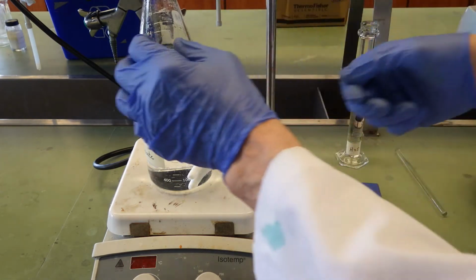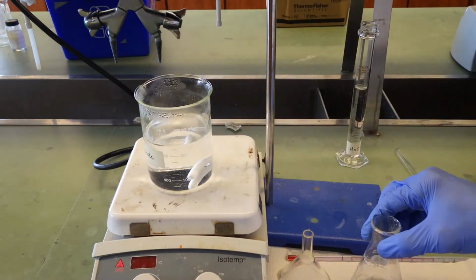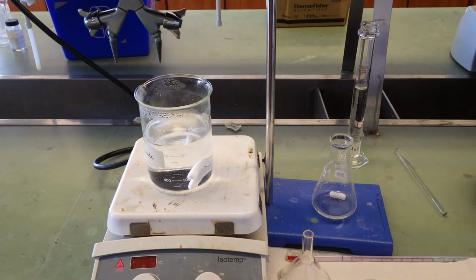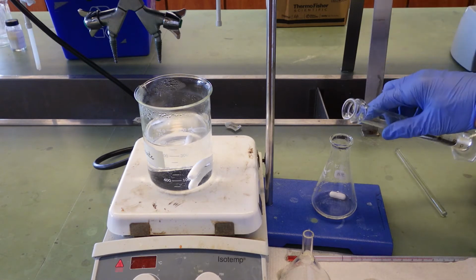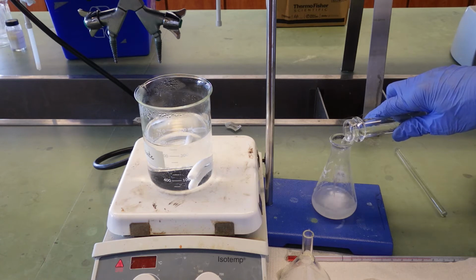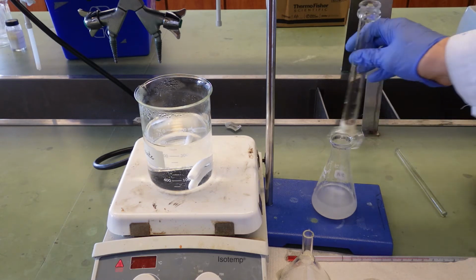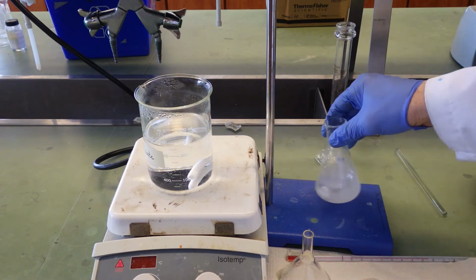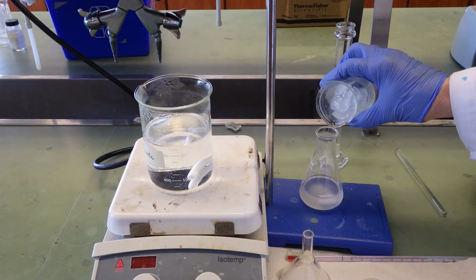Solution looks clear, that's a good sign. We're going to add about 40 mils of water, and that'll cause the ASA to come out of solution. Now ASA is a solid at and near room temperature, but what's come out of solution here is actually another liquid. That is called oiling out. It's not a good thing. We can't filter our solid if it's not a solid.